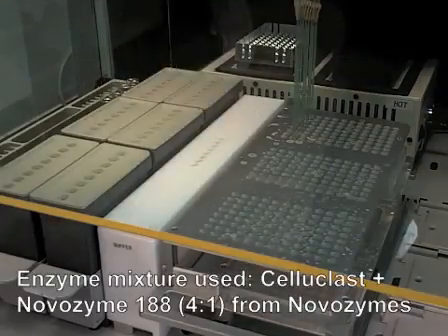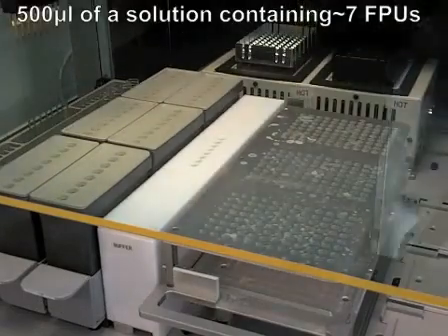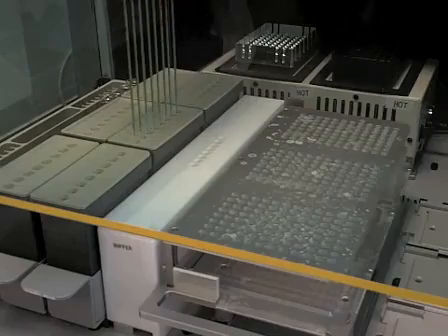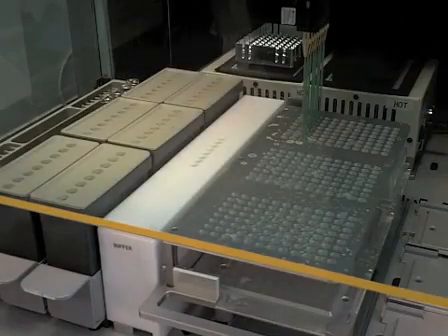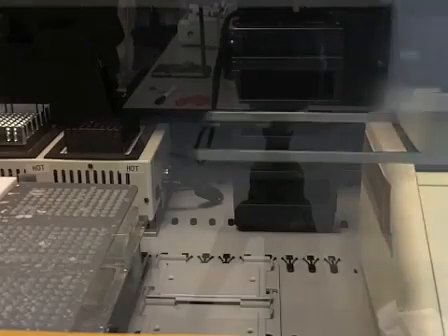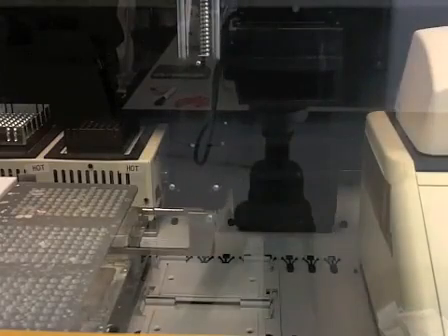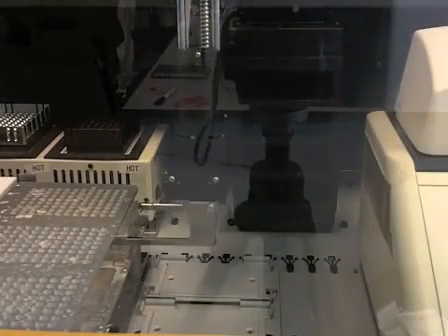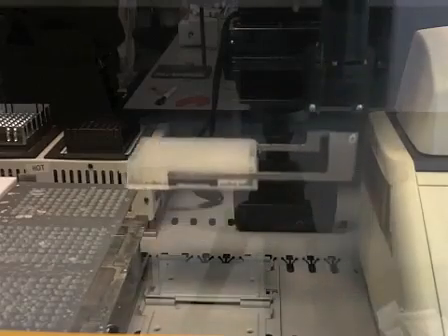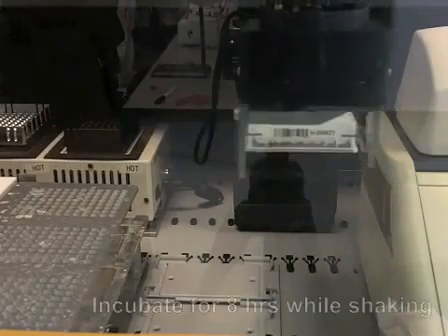Once the pre-treatment is rinsed, an enzyme cocktail is added. It's a standard mixture. It contains cellulase and Novozyme 188 in a 4:1 ratio at a concentration of 7 FPUs per well. The plates are incubated for 8 hours at 50 degrees while shaking.